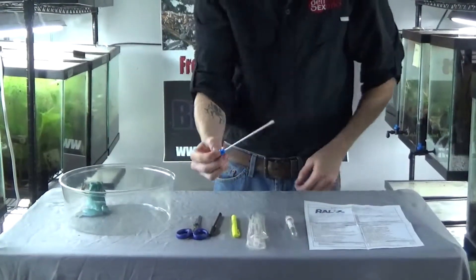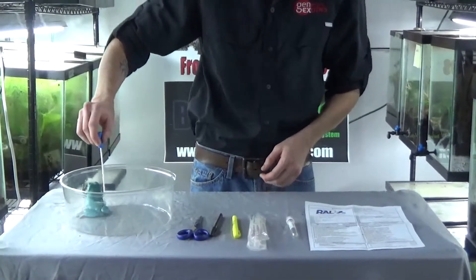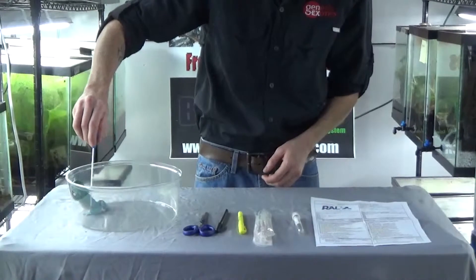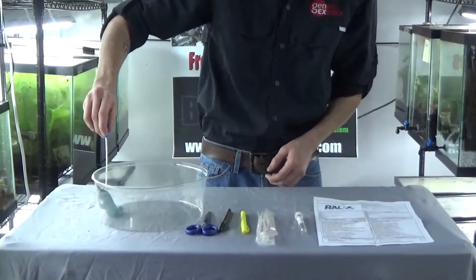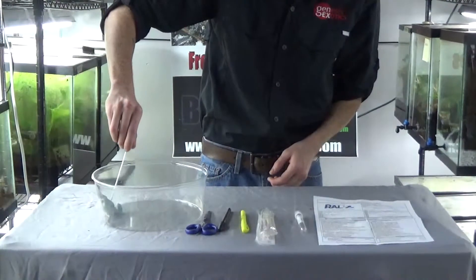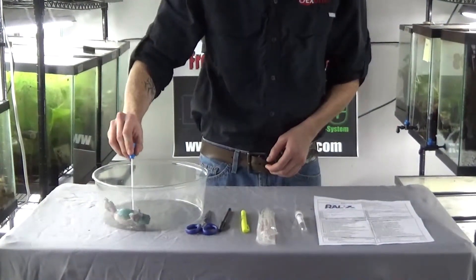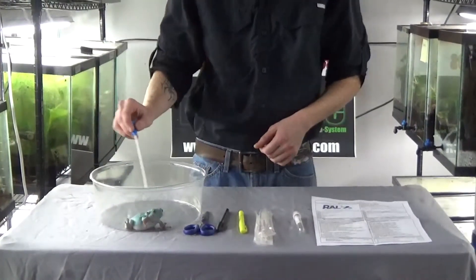You take the swab and swab it all over the animal you are testing — in this case, one of our dumpy tree frogs, who has already been tested for chytrid and ranavirus. You want to make sure you get underneath the legs, in between the legs, under every crevice. For smaller frogs such as Uphaga and Ranatomia, this can be more difficult, so do the best that you can.